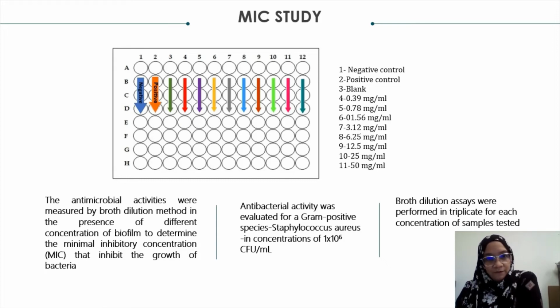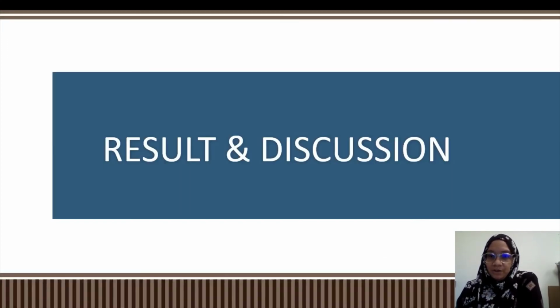A total of 8 different concentrations of extract were prepared. The positive control was bacteria without addition of film extract. Negative control contained only LB broth with 10% DMSO. This well plate was incubated for 24 hours at 37 degrees. The readings were recorded up to 8 hours and after 24 hours of incubation.